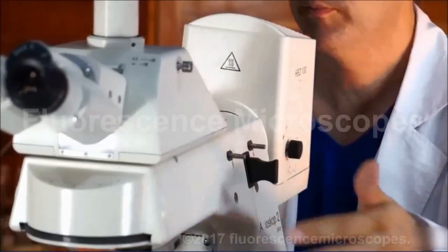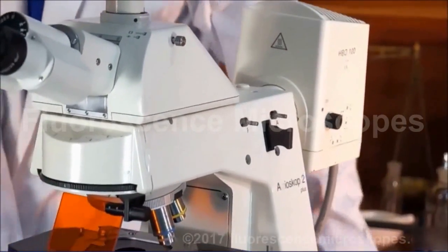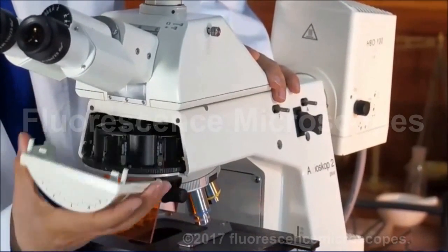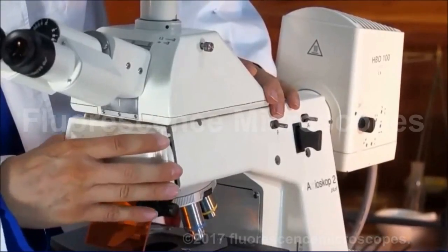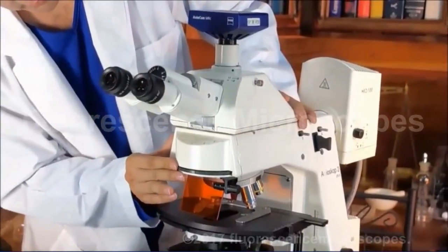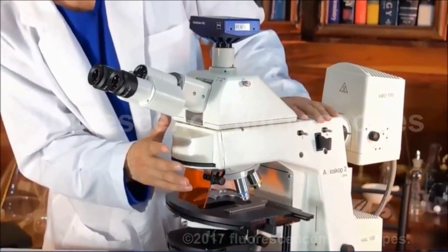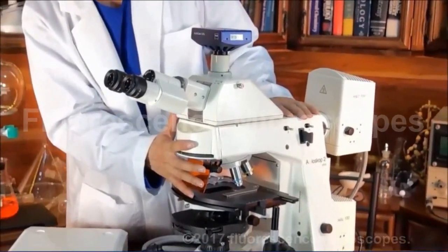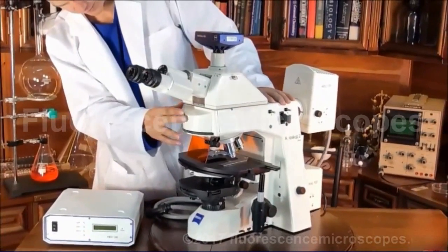And you have your filter cubes. We can put on whatever filter cubes you may want. Just let us know what your needs are. To access them you just take off this cover. This is how you rotate them. You have a total of five cubes that can be held in this microscope. Some of these microscopes only hold four. This particular one does hold five.